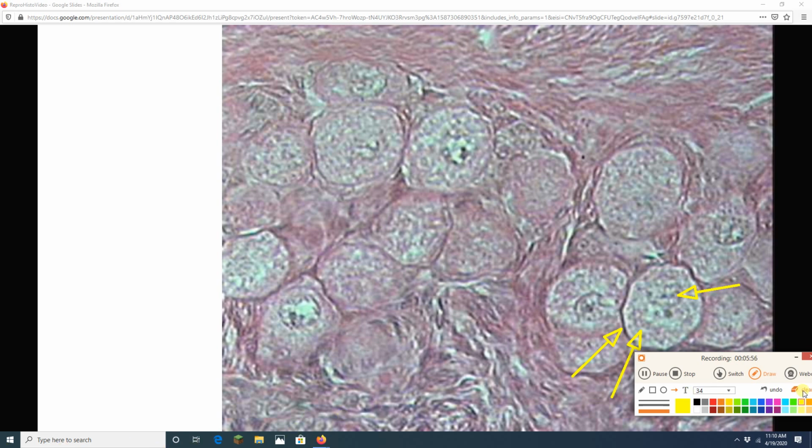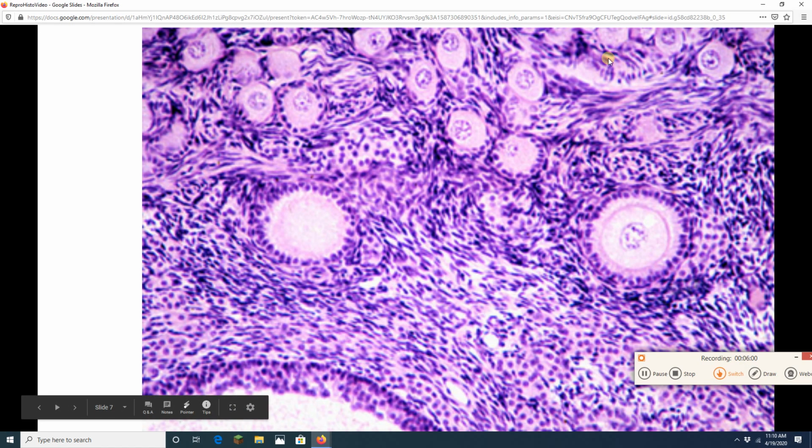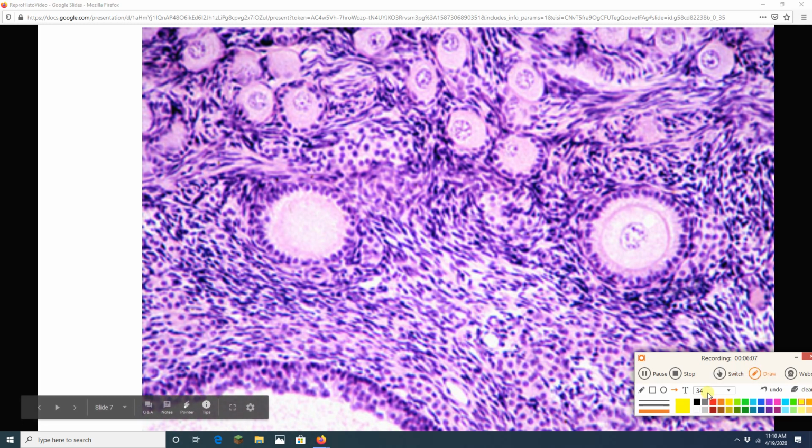Okay, let's look at another ovary. I'll look at lots of ovaries today and tomorrow. Not really tomorrow, today and today. In this video and the next is what I'm trying to say.